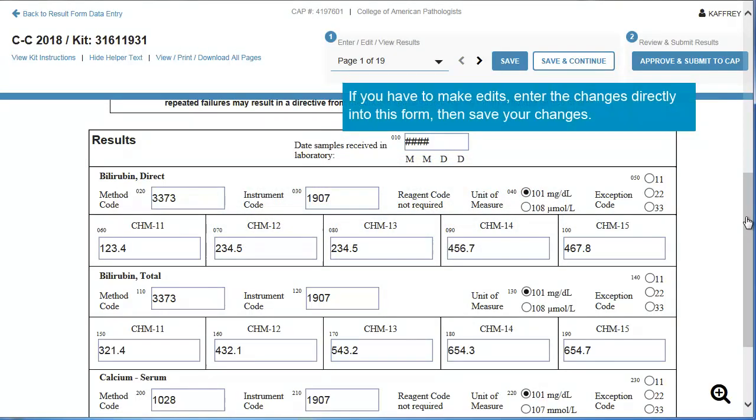If you have to make edits, enter the changes directly into this form, then save your changes.